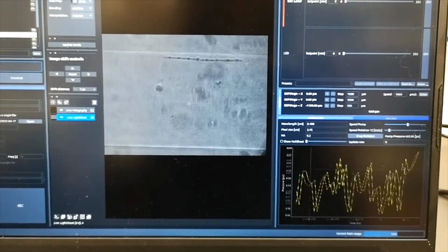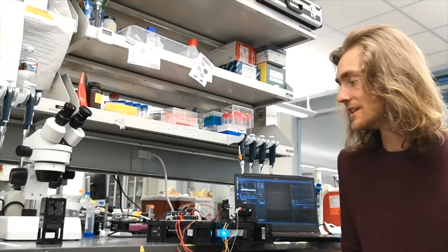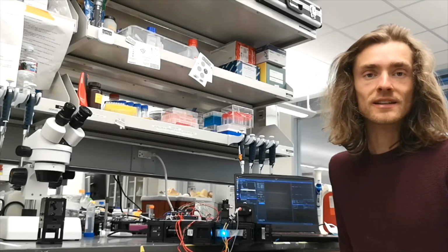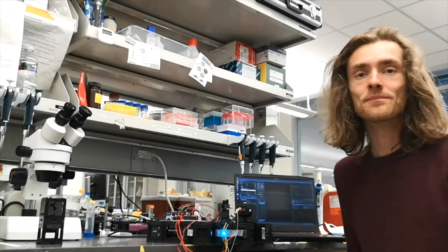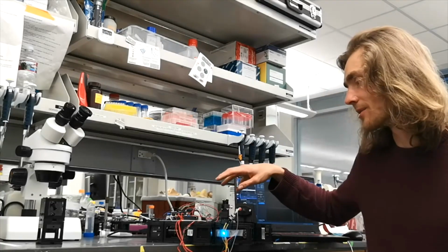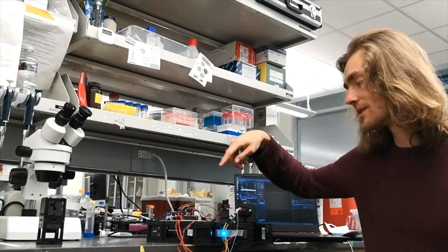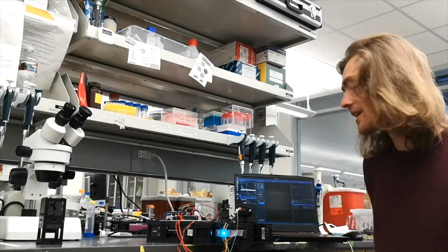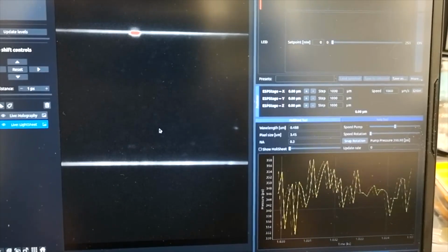That's something we're interested in, so that we can measure the 3D information from plankton from the sea, not only from the autofluorescence but also from the scattering. Hence we wanted to have the holographic part, where there's just a single LED illuminating the sample so that you can measure the scattering on a secondary camera. So we have two cameras, three different actuators, being the pump, the rotator and the focusing stage, and we have a pressure sensor so that we can introduce a feedback loop inside the microfluidics part.